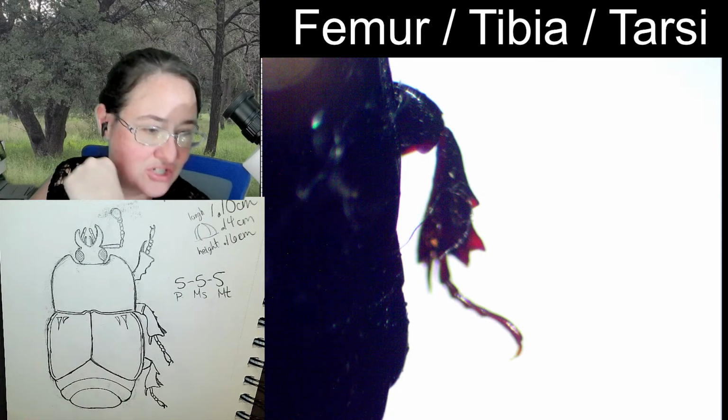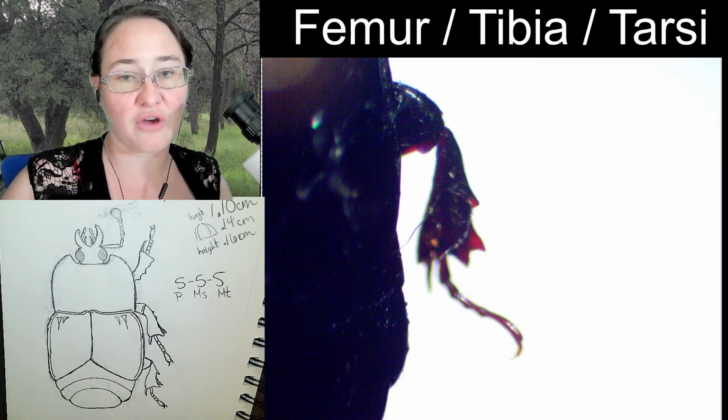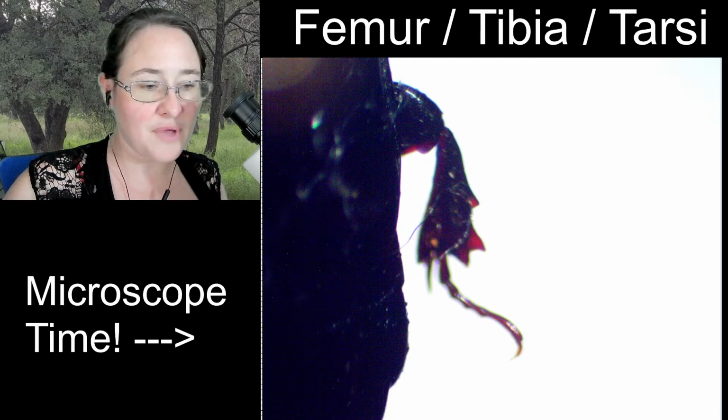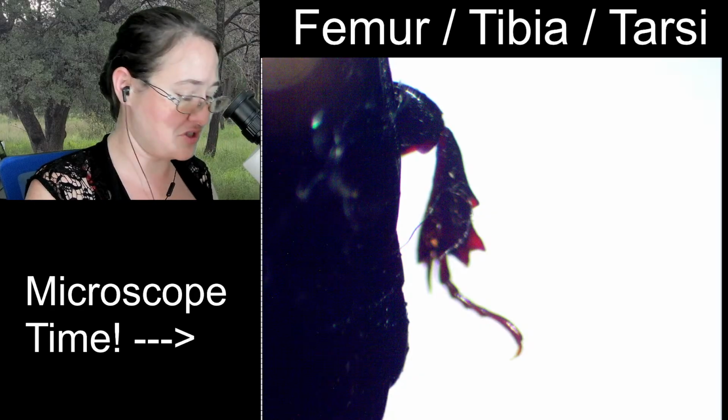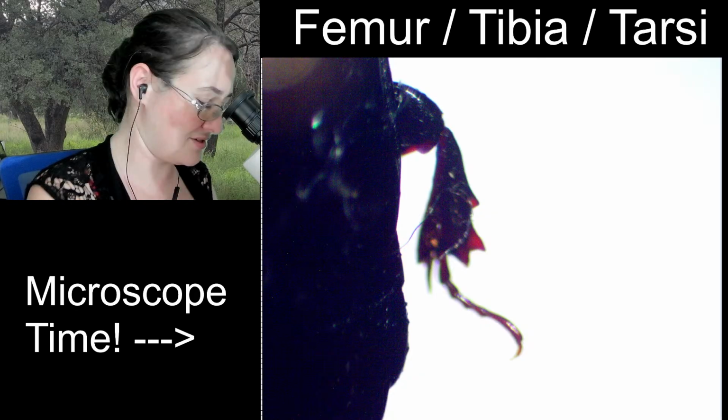Did Hashi and Addie get to see the side view? I don't think so. So, Hashi and Addie, while you are still here, I'm going to turn this beetle sideways for us.